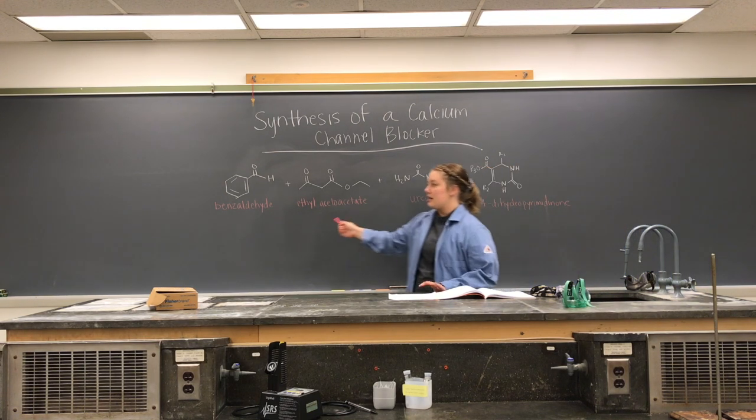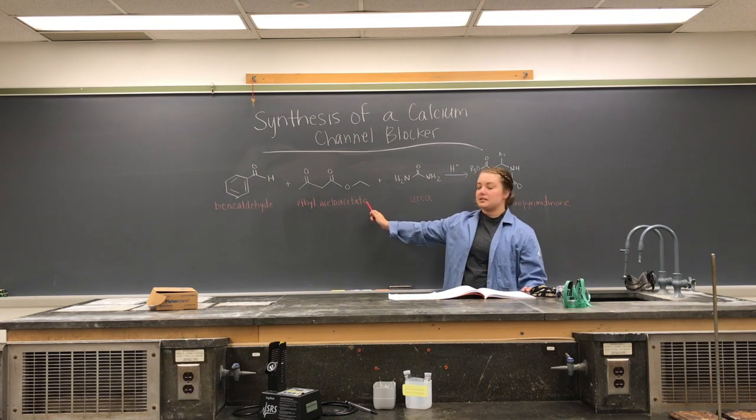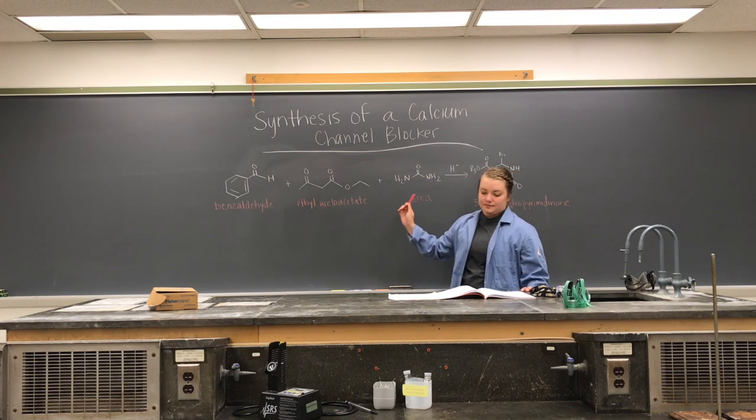And so in our case, our aldehyde will be benzaldehyde. We'll be using ethyl acetoacetate and urea.